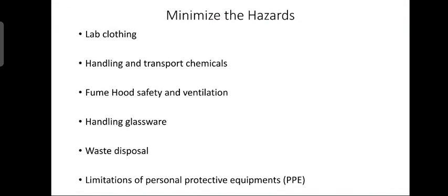Now next is minimizing the risk of hazards. Now this consists of lab clothing, handling and transport of chemicals, fume hood safety and ventilation, handling glassware, waste disposal, and limitations of personal protective equipment.